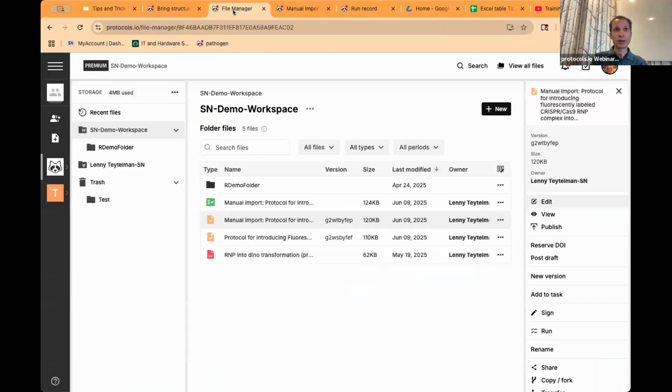So if you're academic and you are publishing protocols and including them in a peer-reviewed submission for a journal, if these are part of a paper, you don't have to take each individual 10 protocols that you have and add them one by one into the paper.